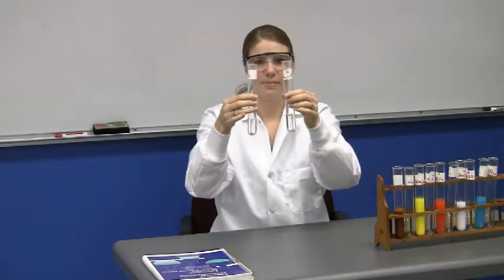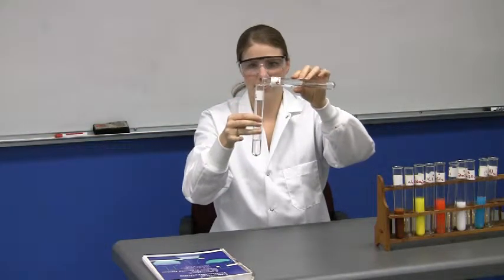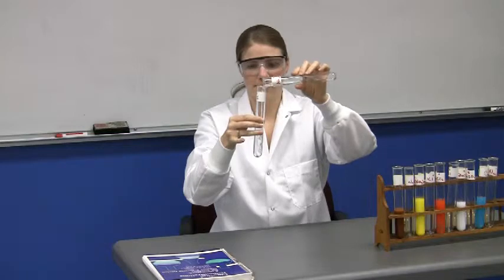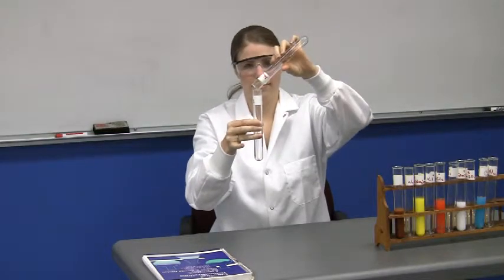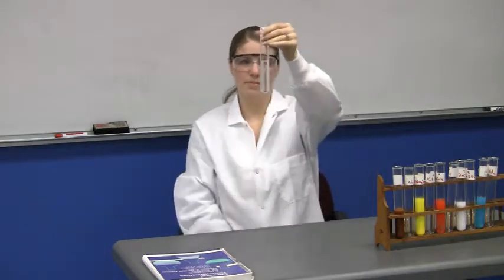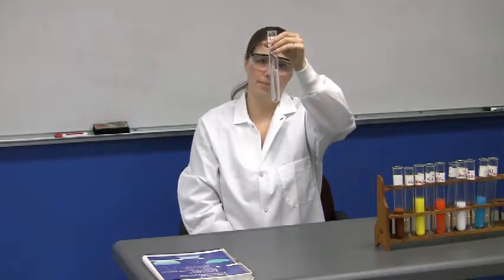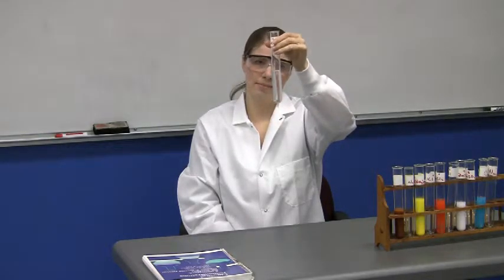It contains Na2CO3 plus KI. And this is sort of the case where you see no solid. So when the students predict the products of this reaction, they should have aq after the formula of both products, because as you can see, there's no precipitate.